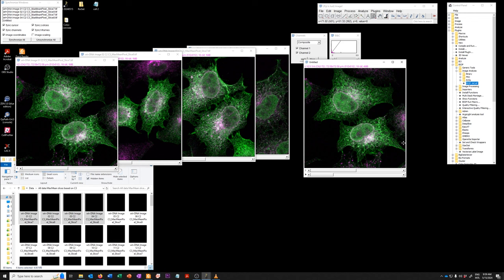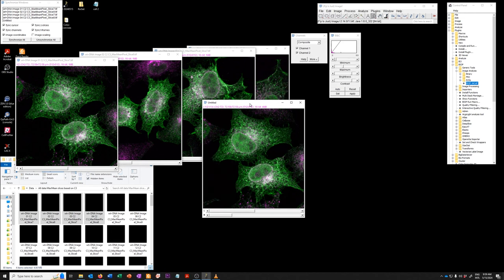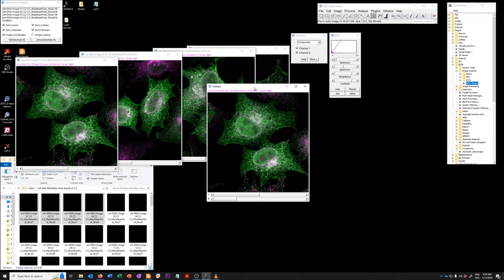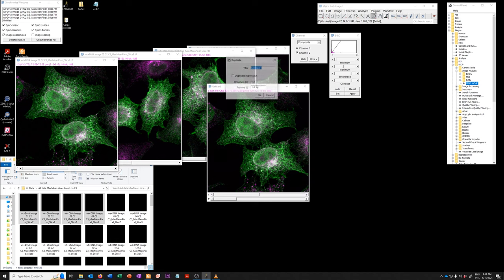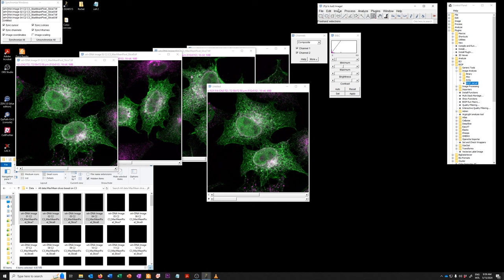And then once you have this, you can sort of do whatever you want with the duplicate tool. For example, you may just want one of the channels. So you can use the duplicate command, which we already went over in some of the exercises.